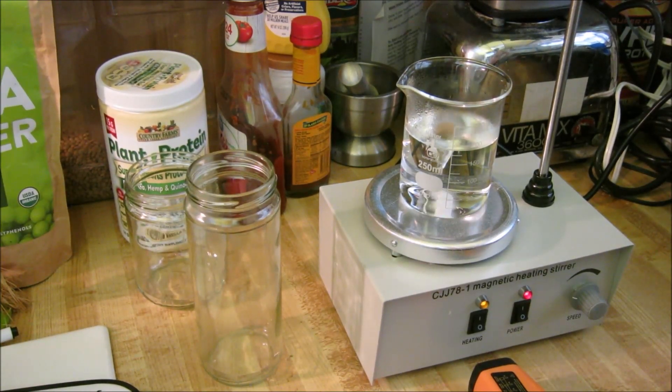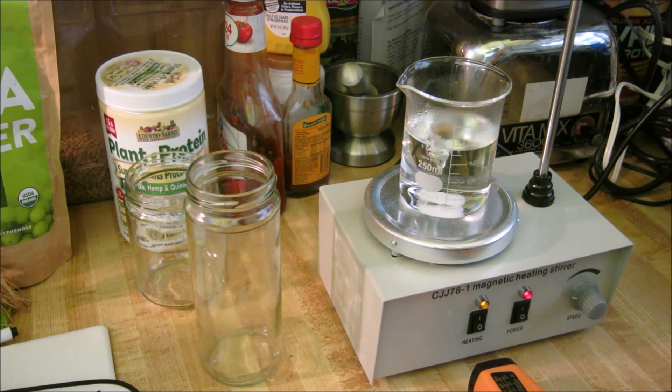Hey YouTubers, Rob Moffitt, guys. Today I thought I'd do a really quick review of a magnetic stir hot plate I bought.